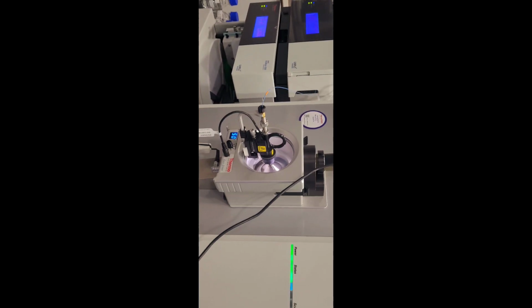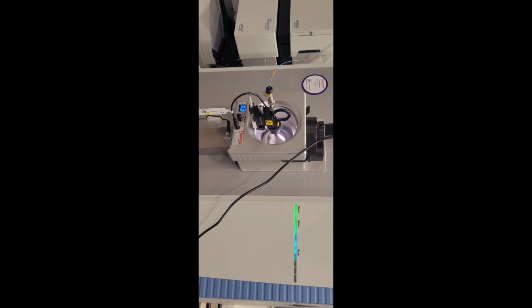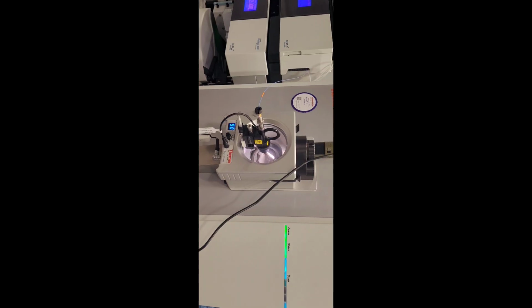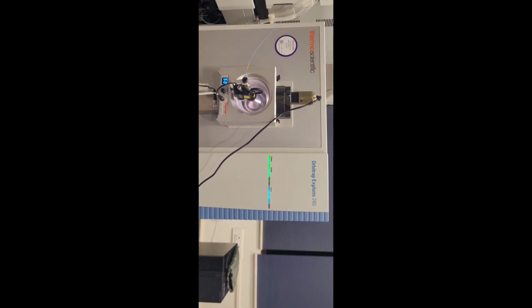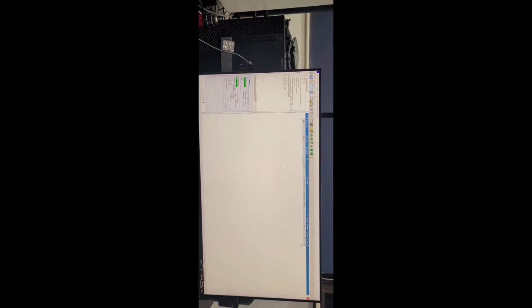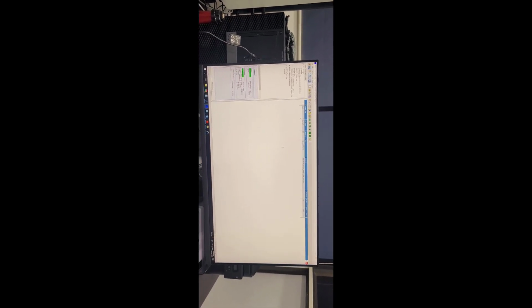It must be less than 1 microgram. To maintain this amount of sample, we have to inject accordingly, in microliter volume. That's all, and now we are about to give the queue, and after that the instrument will take each of the samples for acquisition.